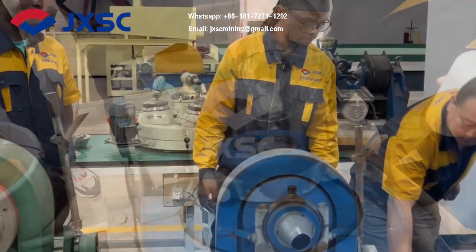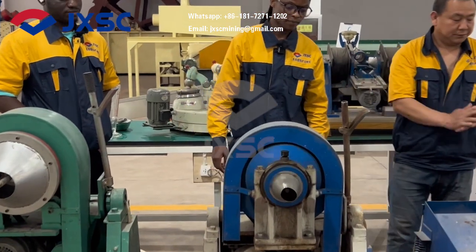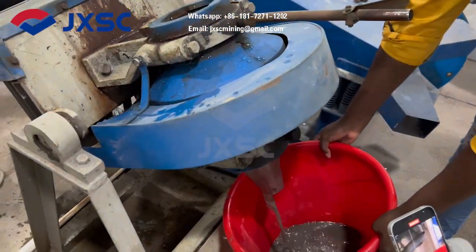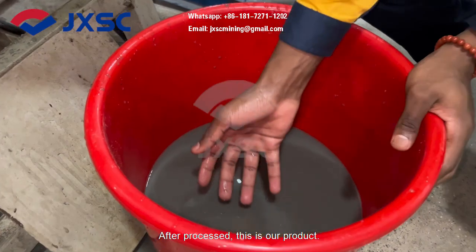It's also going to add some water. After the process, this is our output.